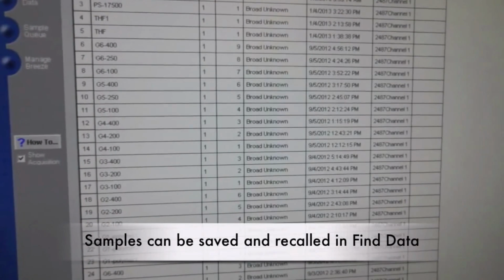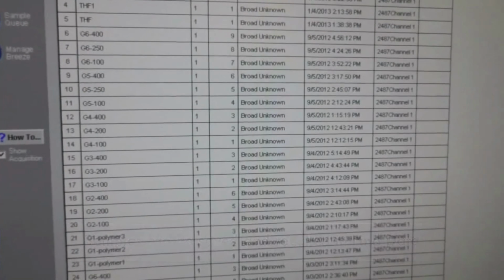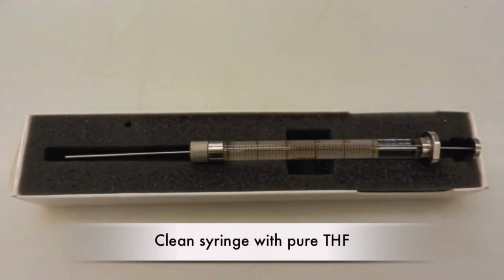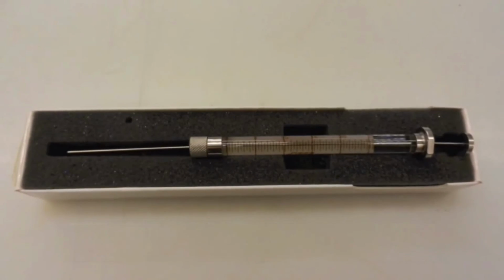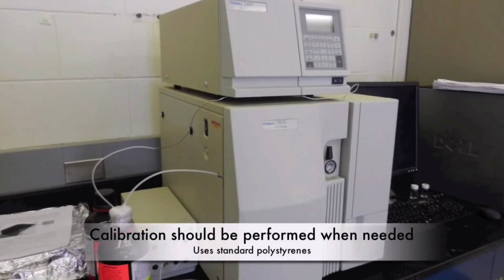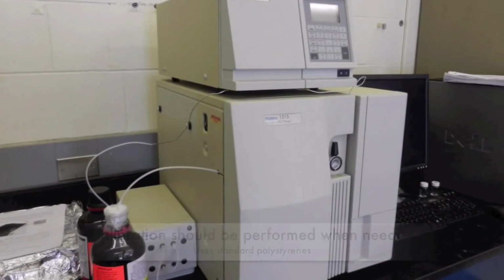Once completed, the sample will be saved within the software and can be recalled in the list provided under the Find Data button. Once your test is finished, clean the syringe by pumping pure THF through it several times. Calibration should be performed when needed. This consists of analyzing standard polystyrenes with several molecular weights.